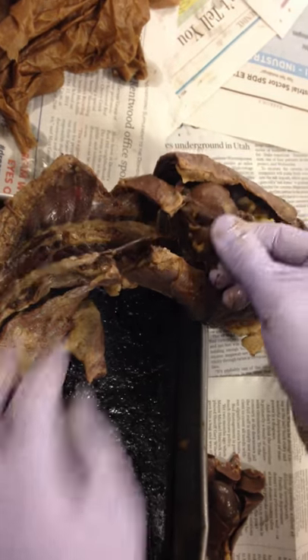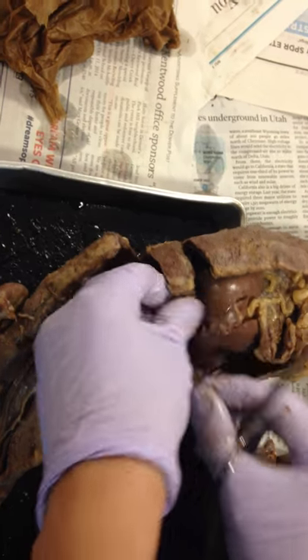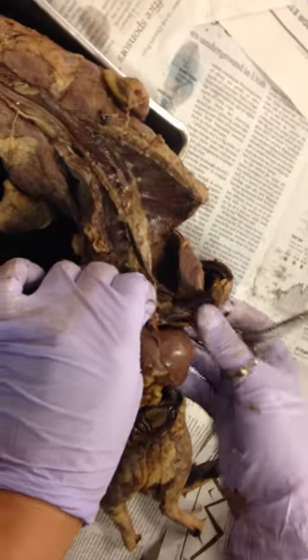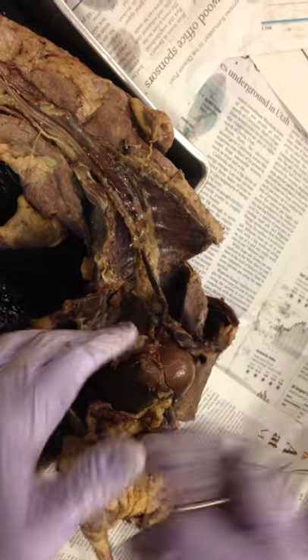Do you see that? So the first thing I'm going to do is take my scissors. I'm going to be aware of where my esophagus is, and I'm going to cut through my diaphragm lower and lower until I can see where my esophagus kind of pokes through. Do you see that in there? So I'm going to snip lower until I've gotten to the esophagus. Okay.